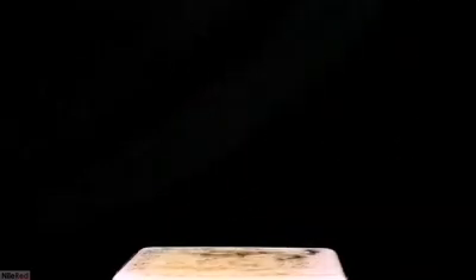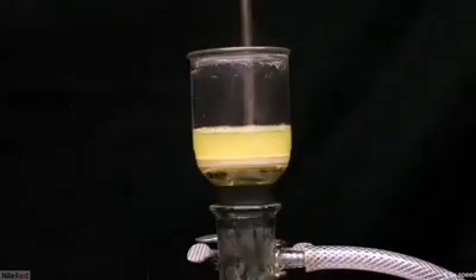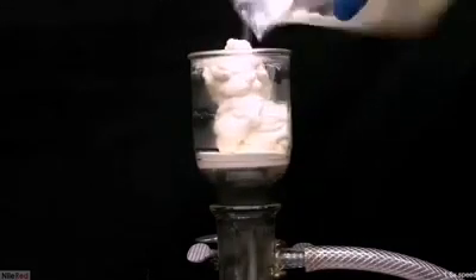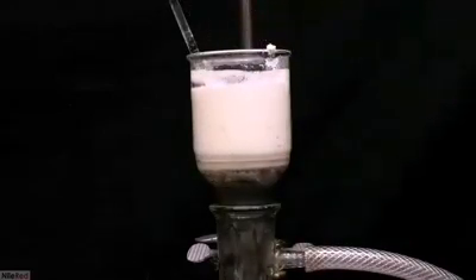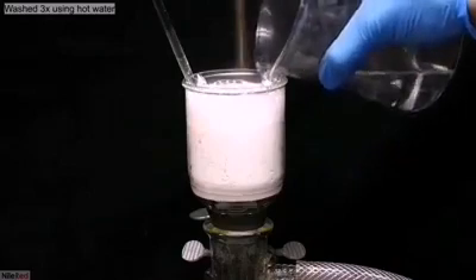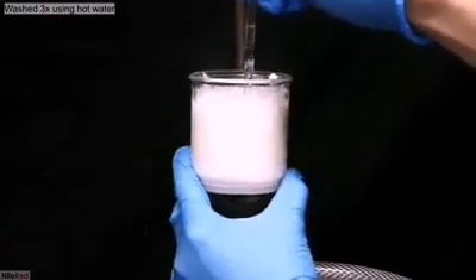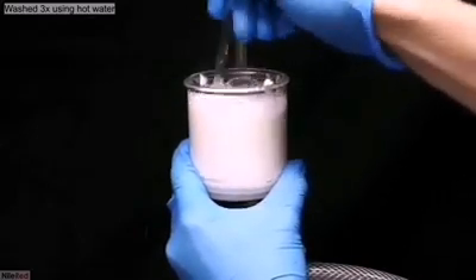The mixture was taken off the heat, and the calcium citrate very quickly started to settle at the bottom. While still hot, I went ahead and vacuum filtered it off. A little bit of hot water was used to wash the beaker, and everything was transferred to the filter. I then added some hot distilled water and thoroughly mixed things up to wash the calcium citrate. Once I felt it had a good wash, I turned on the vacuum and pulled away the water. I repeated this washing step 2 more times for a total of 3 washings.